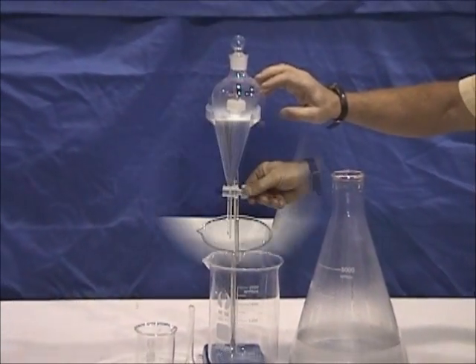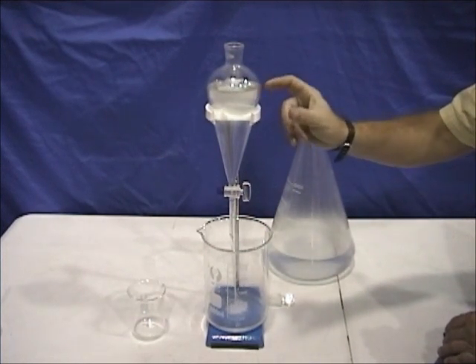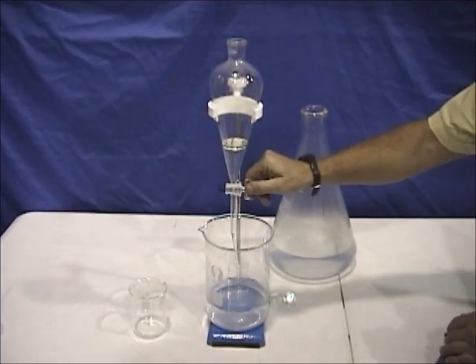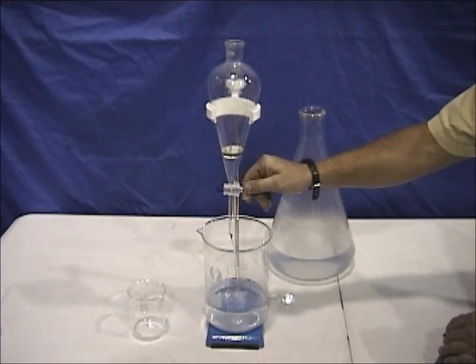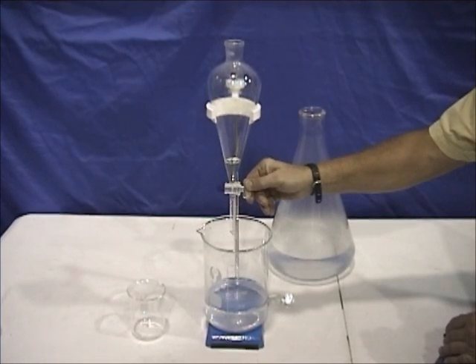The next step is to separate the oil from the hydrosol, and to do that we're going to use a separatory funnel. As the liquid goes down and gets narrower you'll see the oil better and better. I'm going to go until all the hydrosol is out, then stop right when we get to the oil — bam!